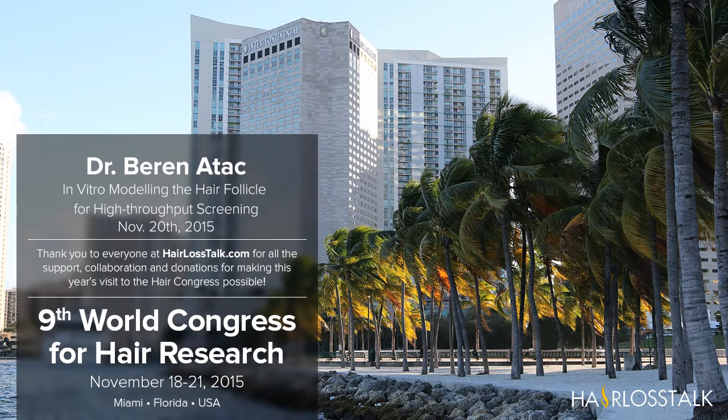Like keratin 75 and keratin 71 have a higher expression over time, and 85 and 82 get more organized during the maturation of the organoid. So with that, we even did electron microscopy, which I have to say was a big challenge, because we have the resolution of an organelle inside one cell, but the size of the whole organoid is like 200 to 400 micron.